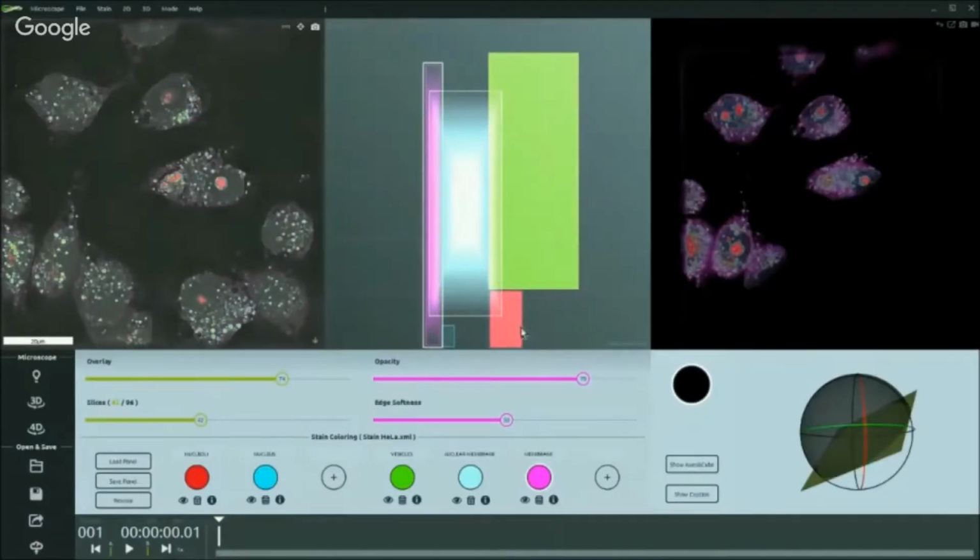One thing you can do, for example, on this sample is, if you know your media, like we know that this is taken in PBS, and in PBS the refractive index is 1.333, you can set this refractive index like this.